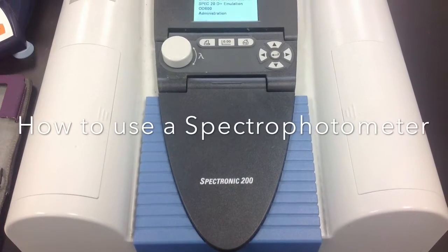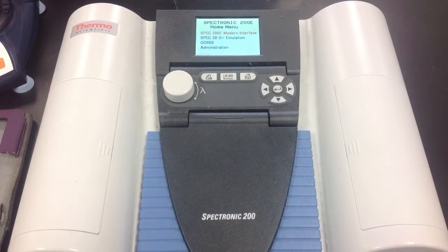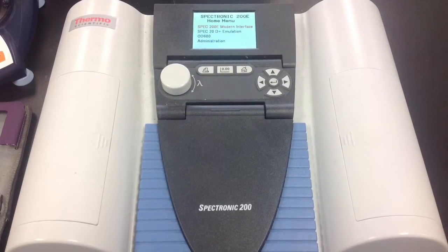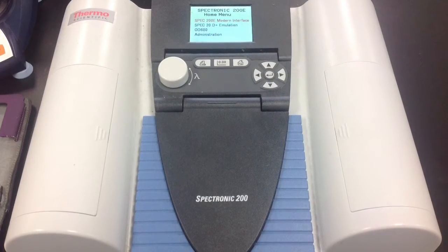How to use a spectrophotometer. A spectrophotometer is an instrument used to measure the amount of light of a particular wavelength absorbed by a sample in solution. It is primarily used to identify substances and determine their concentration. A spectrophotometer measures the light intensity at selected wavelengths.